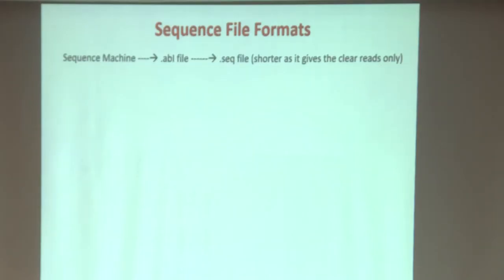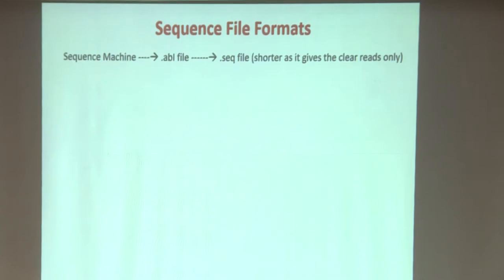Today we are going to talk about how we are actually analyzing the sequence to know about the phylogeny, to know about what features they have, and how you do the annotation of the sequence and other things.